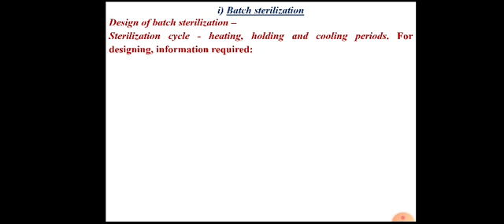As we have learned, the sterilization cycle consists of heating up period, holding period, and cooling down period. These three are very important, and in order to design the batch sterilization process, the following information is required.